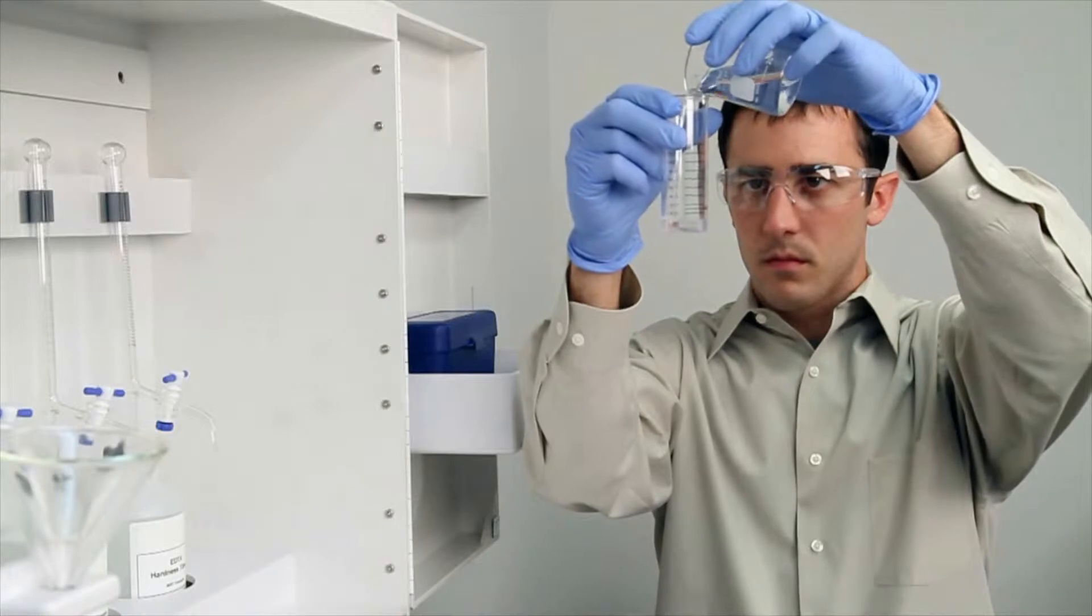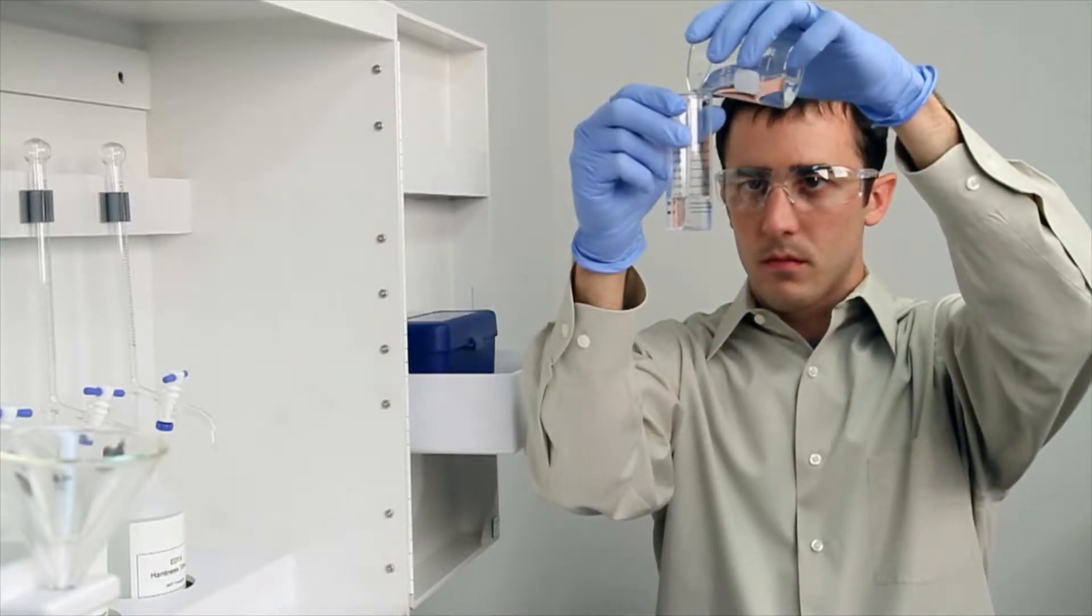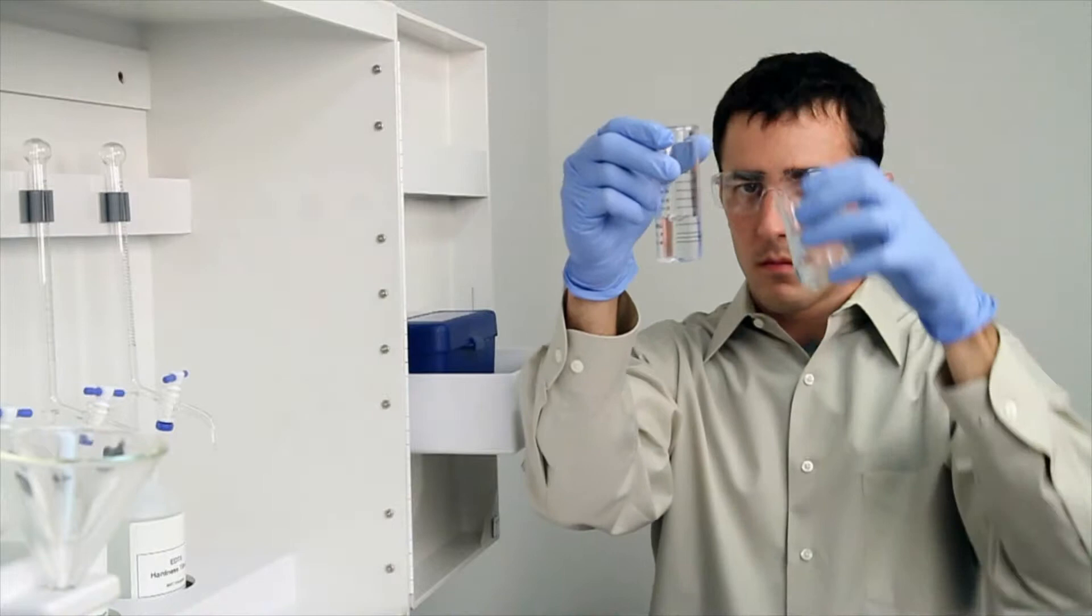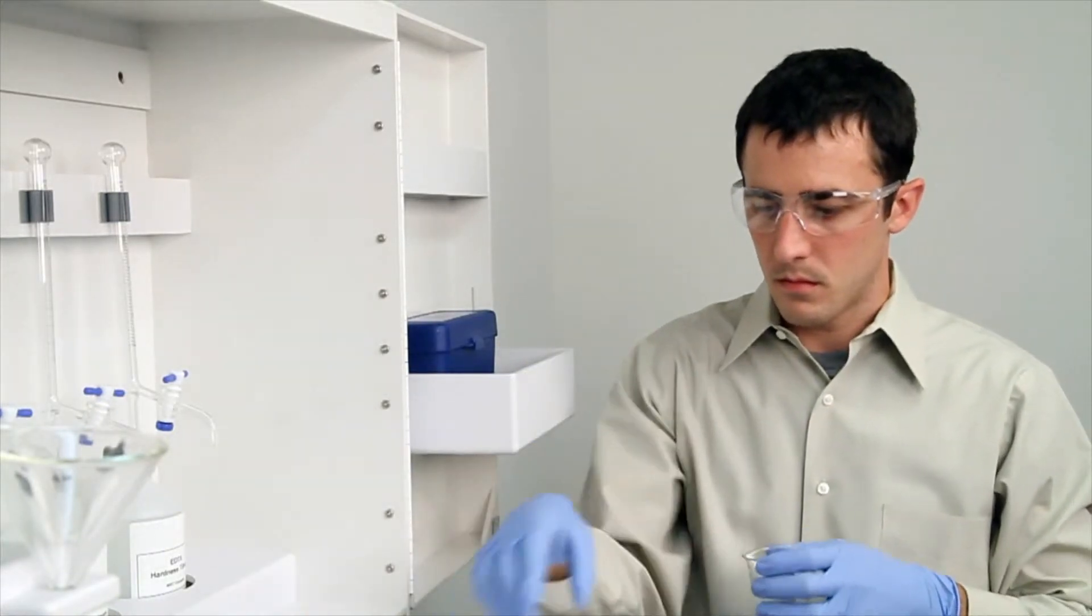To get an accurate sample size, you want to hold the vial close to eye level. Once you feel you have an accurate sample, place the vial on a level surface and bend down to eye level.